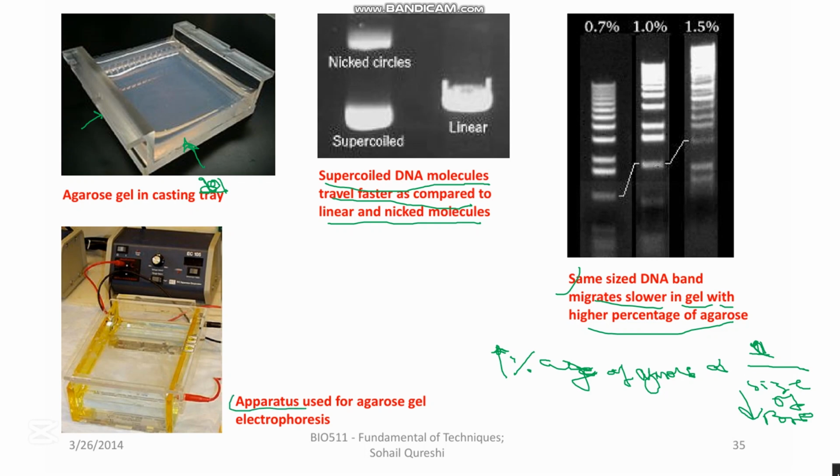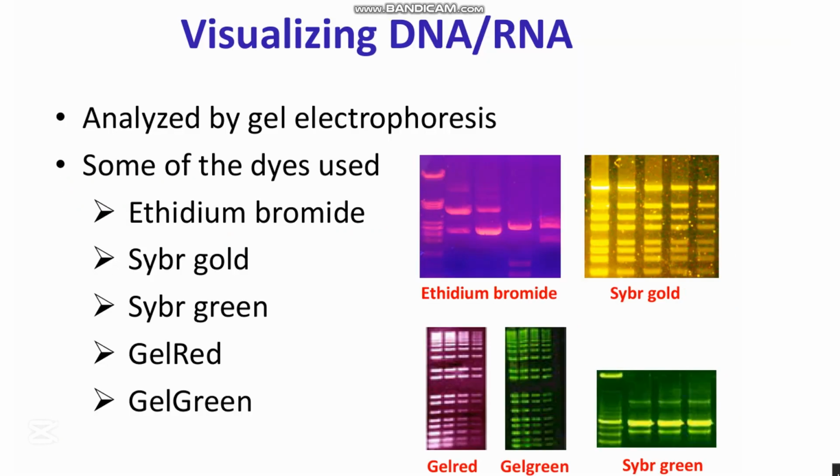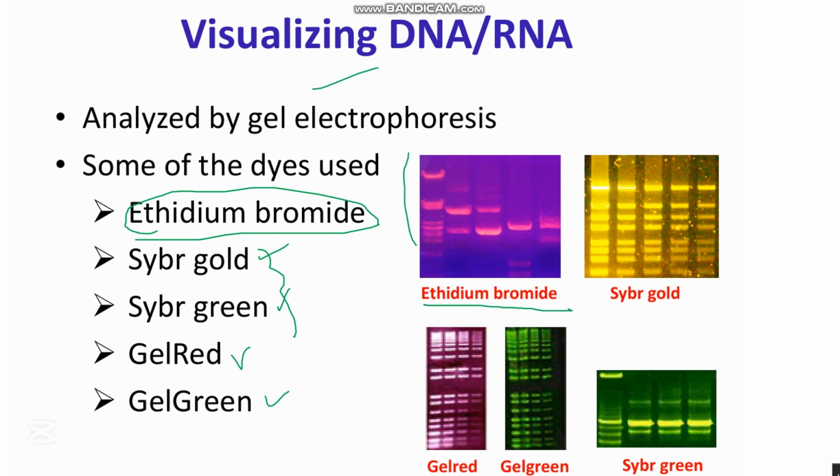And this is the apparatus of gel electrophoresis, in which this is the power supply, this is the caster, and this is the container. And how we visualize the DNA or RNA, as already mentioned, we use ethidium bromide. If you don't have ethidium bromide, you can also use SYBR Gold or SYBR Green. In real-time PCR, we use SYBR Green, SYBR Gold, and we also use GelRed and GelGreen. With ethidium bromide, we get a pinkish color; with SYBR Gold, you get golden; with SYBR Green, you get green, and likewise with GelGreen and GelRed.